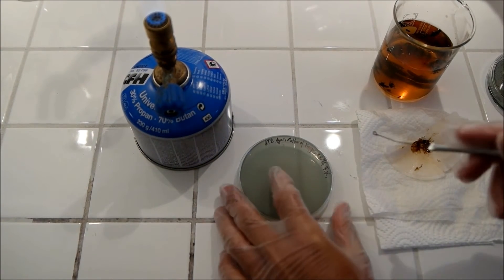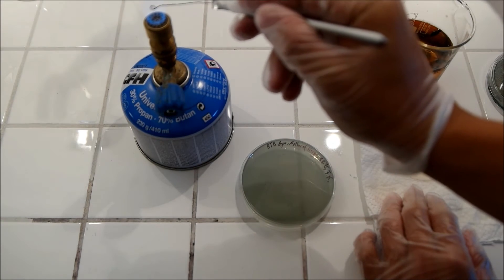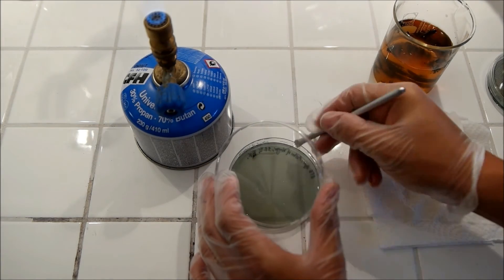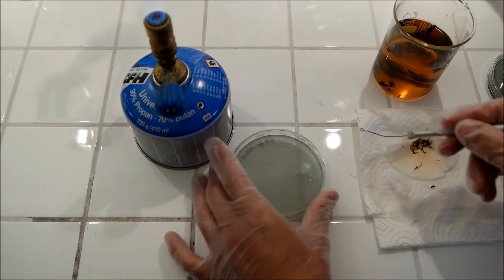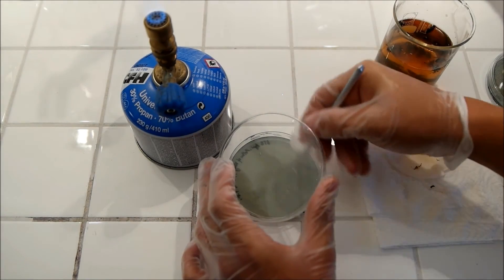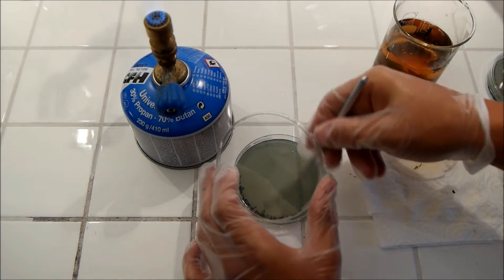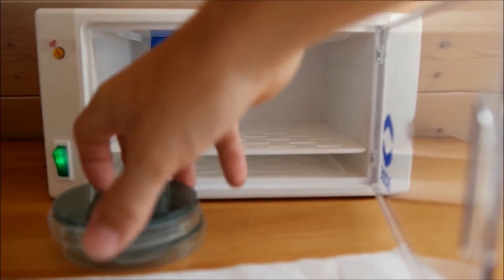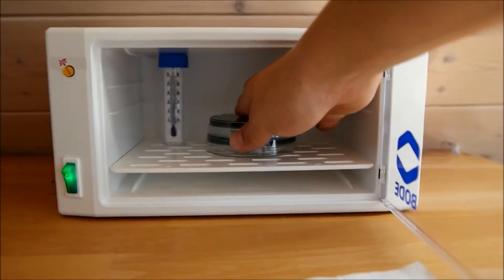Now that was the beer sample — let's take the mother of vinegar. Finally, put your two agar plates in your incubator at around 30 degrees Celsius.